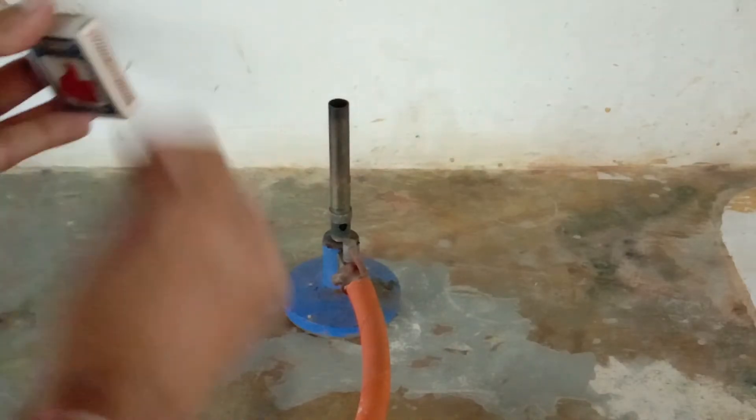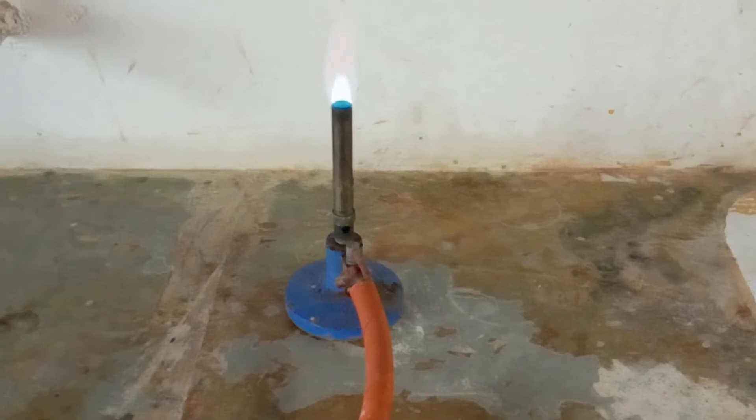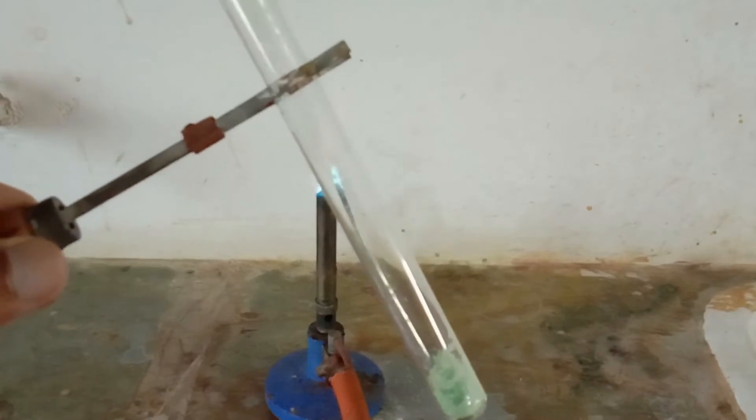Let's light up the Bunsen burner. With the help of a spatula I have collected some amount of ferrous sulfate in the test tube, and I'm going to hold the test tube with the help of a test tube holder above the flame.